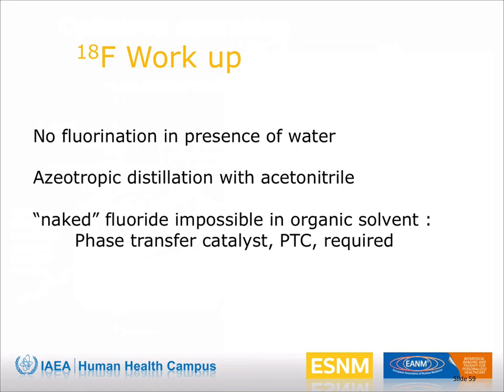Because the resulting potassium fluoride salt is insoluble in acetonitrile, a phase transfer catalyst is added before the distillation process. The most often used phase transfer catalyst is cryptofix, but also tetrabutyl ammonium hydrogen carbonate is often used. The methods are presented in the next two slides.